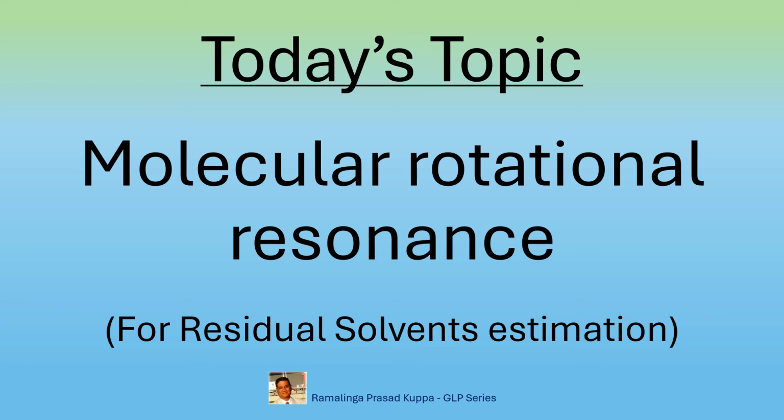Today's topic is molecular rotational resonance for residual solvents estimation. The standard test method for residual solvents or organic volatile impurities is USP Chapter 467. As a supplement to the existing test method, the new molecular rotational resonance (MRR) technique is developed.